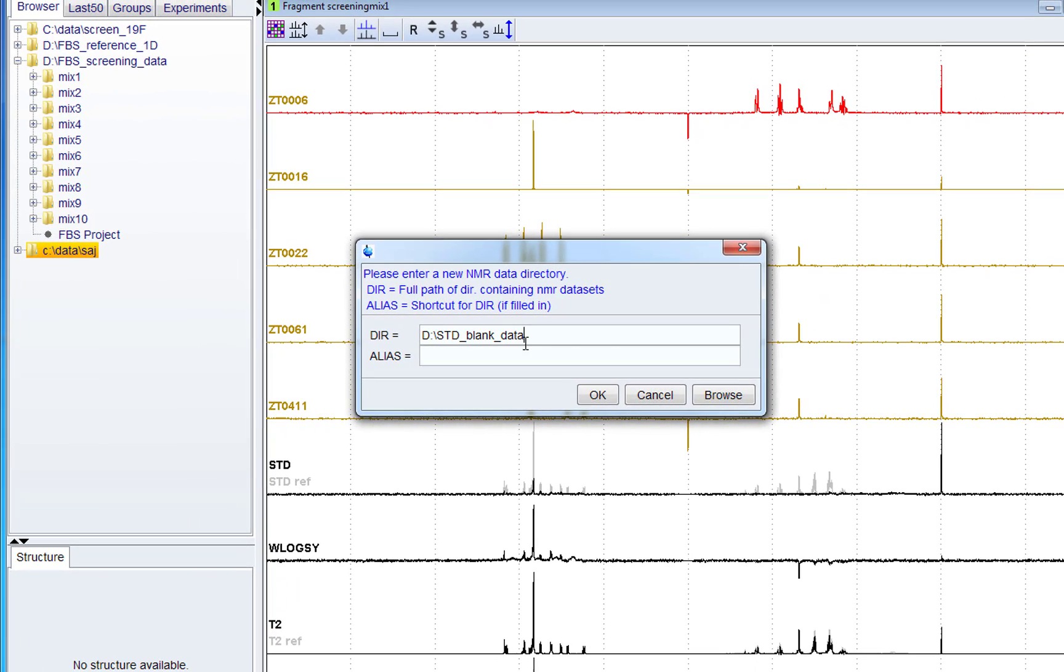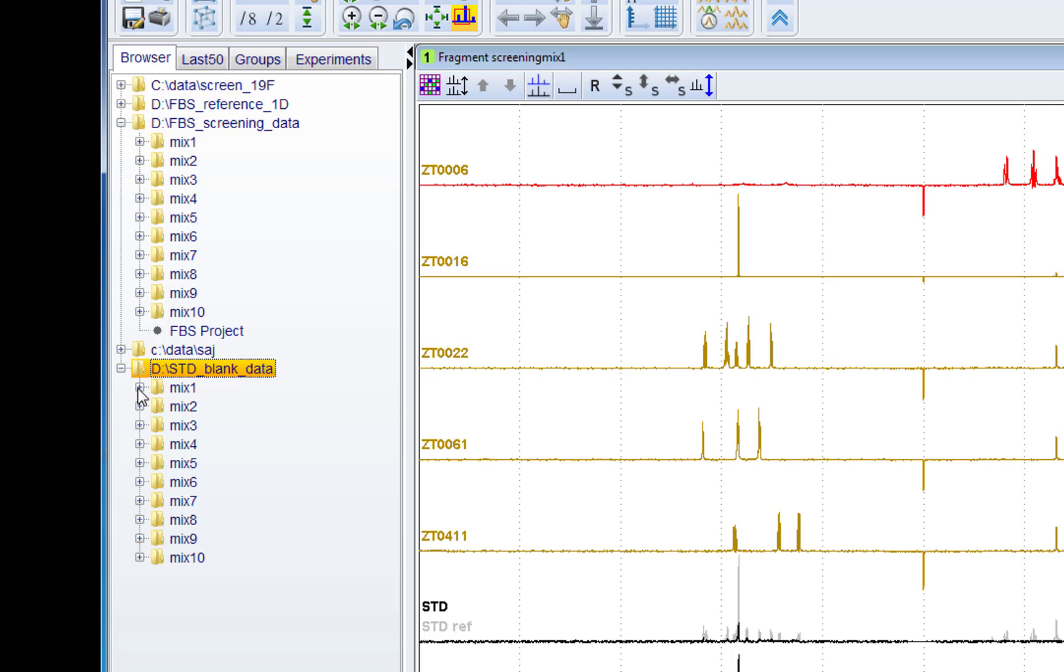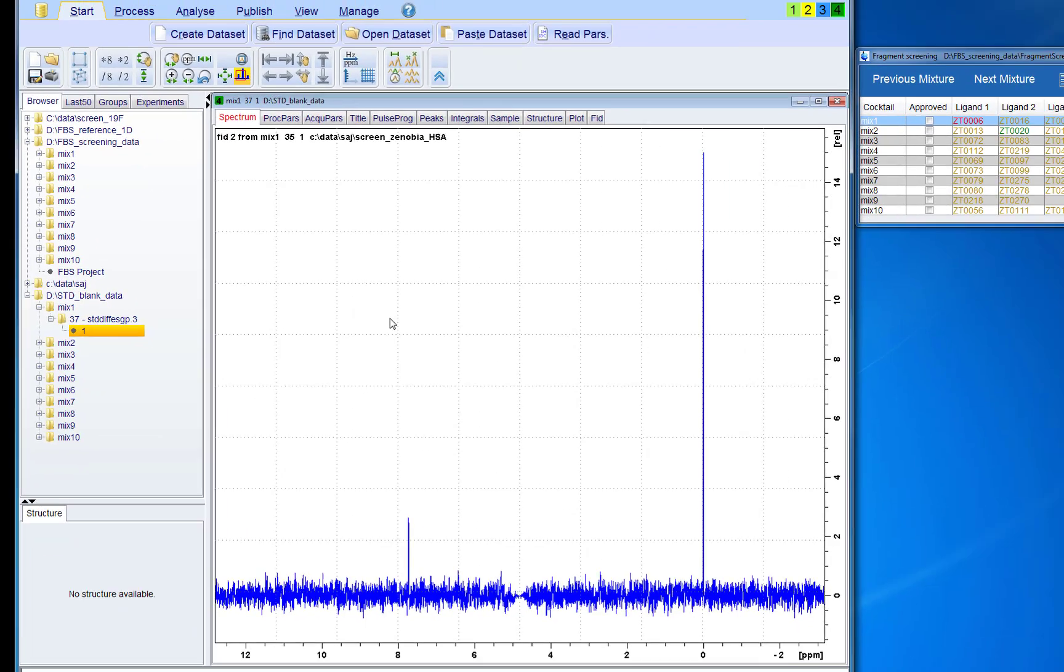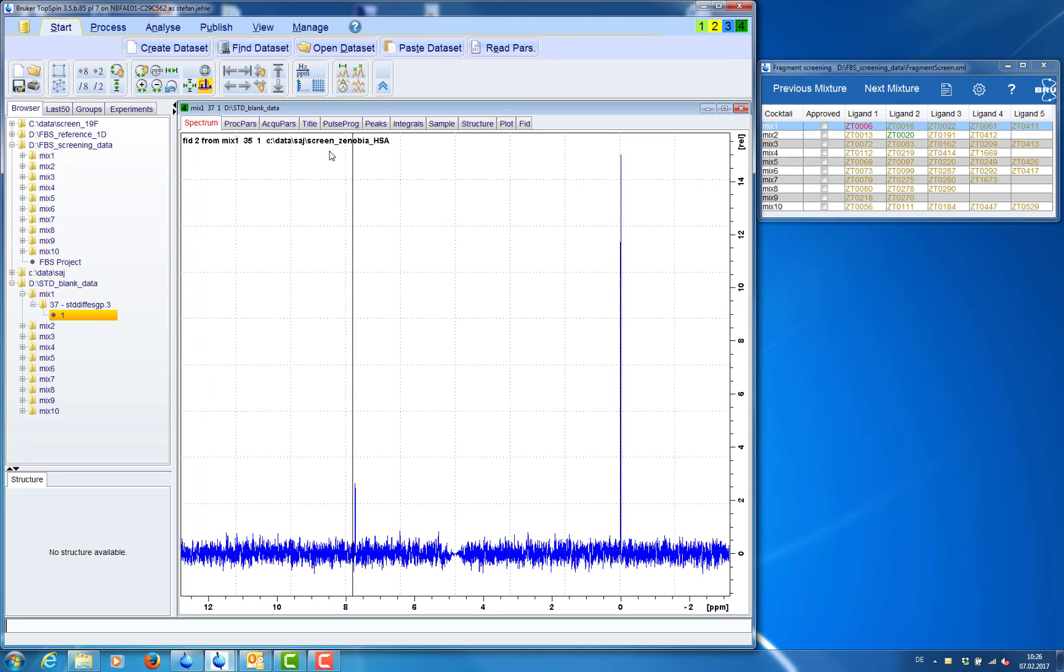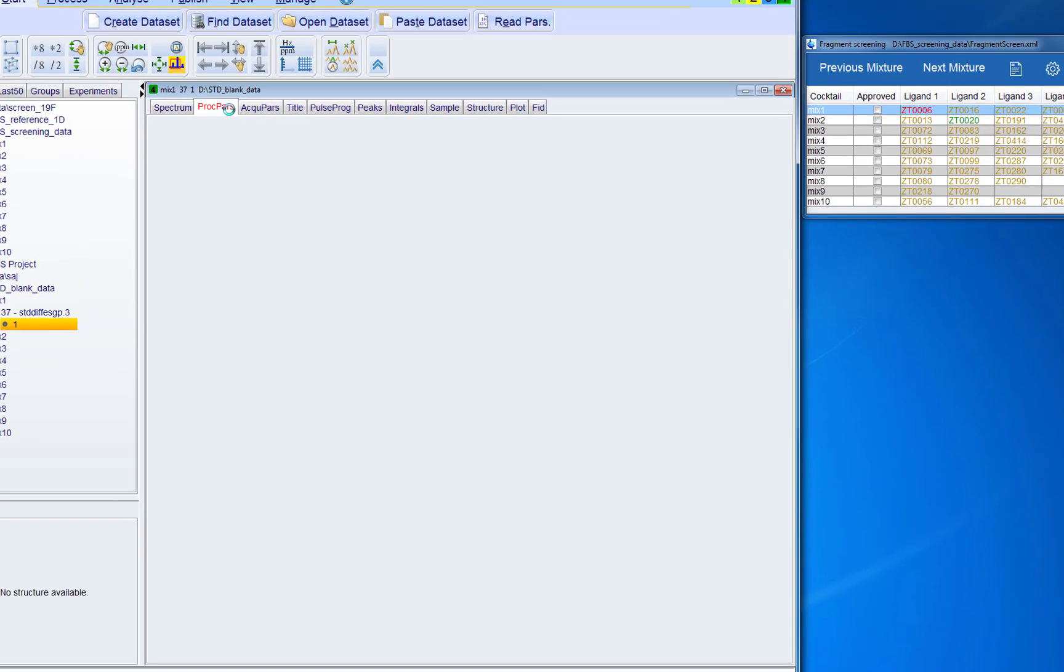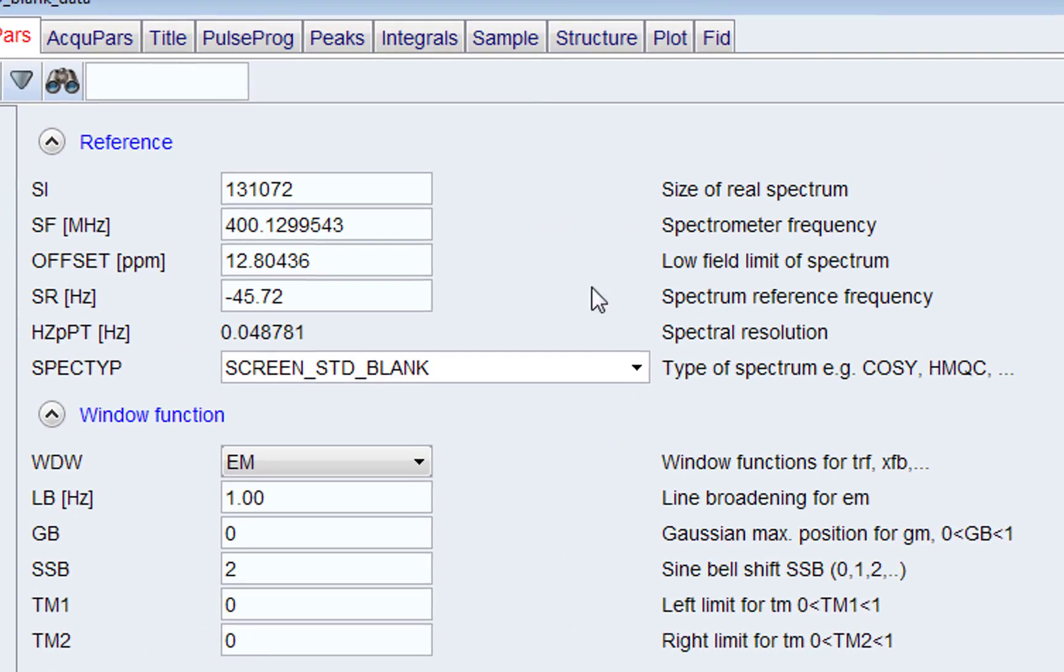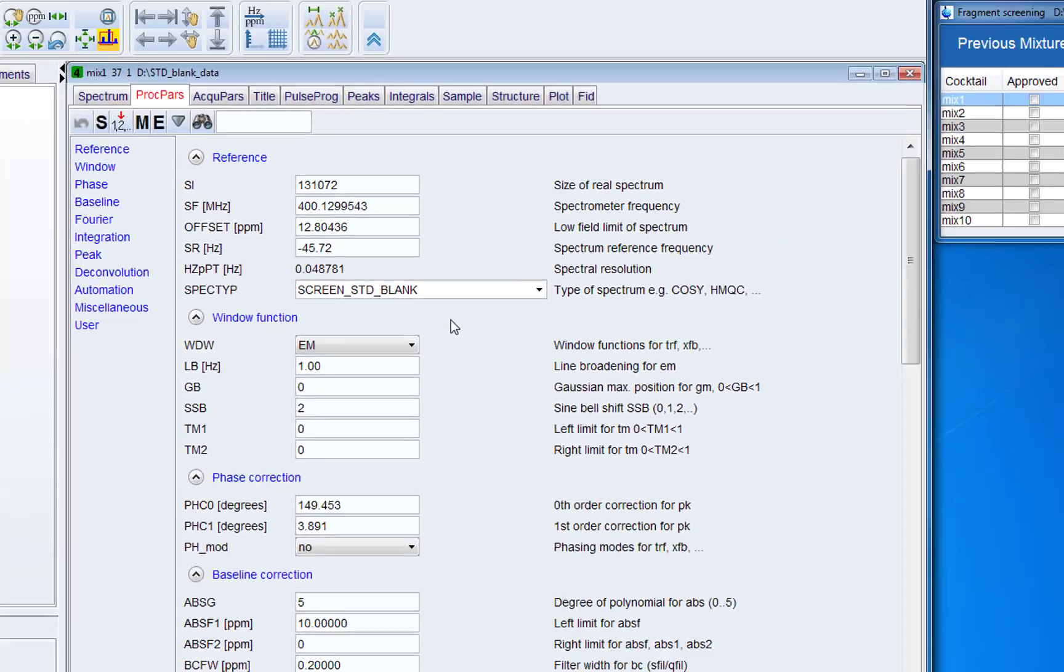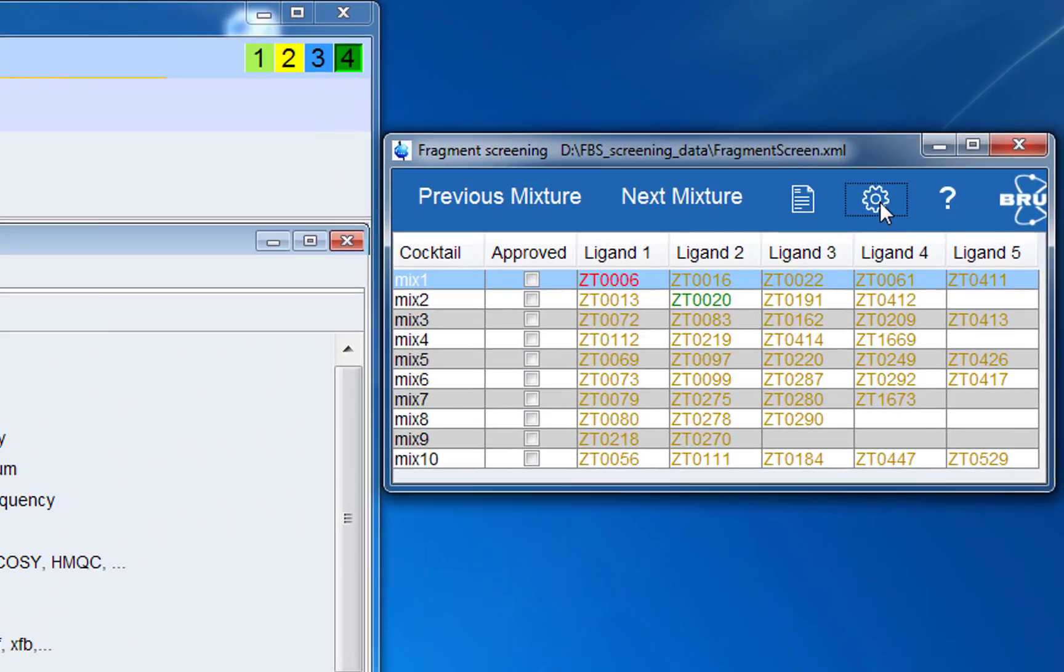So now right click in the data panel we can add a data folder. Now in this data folder we open from mixture 1 for example this blank spectrum. And we check which spec type we have used to measure the spectrum. This is in the processing parameters. In the status processing parameters there is the spec type. In this case it is screen std blank.